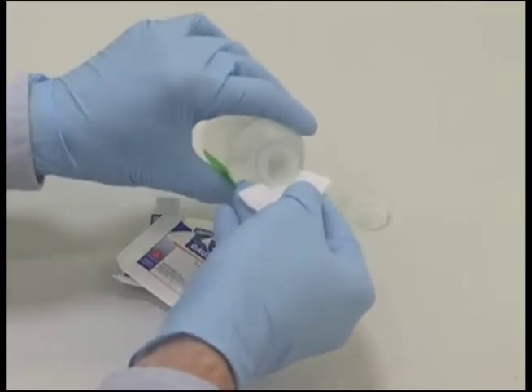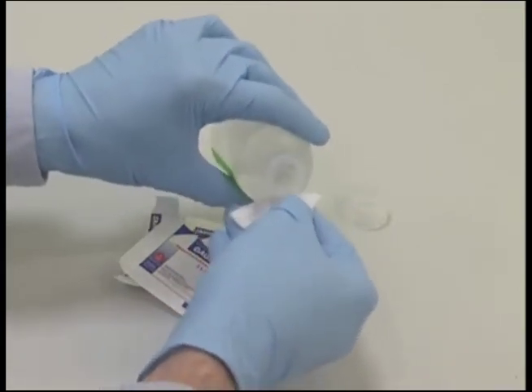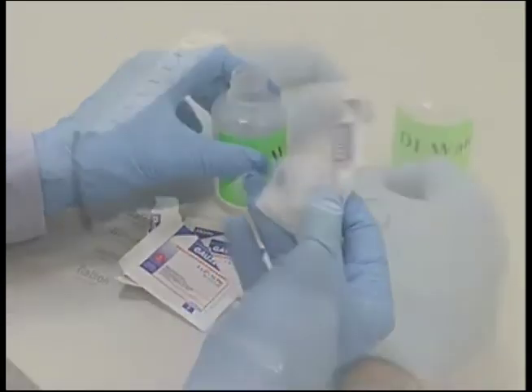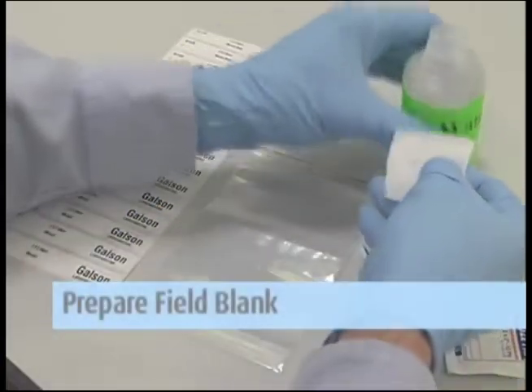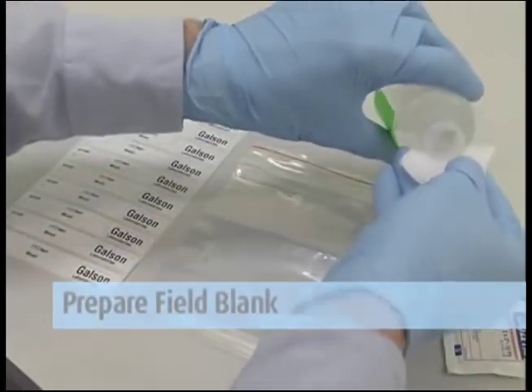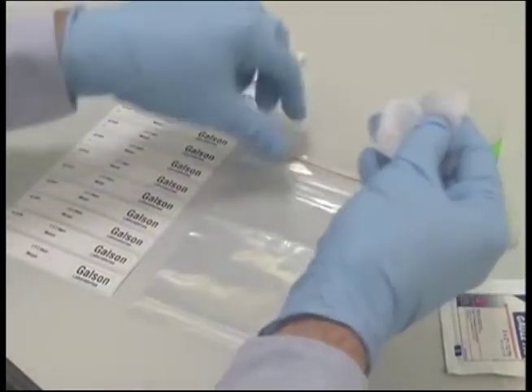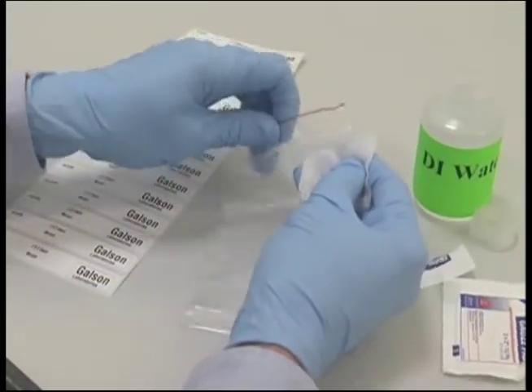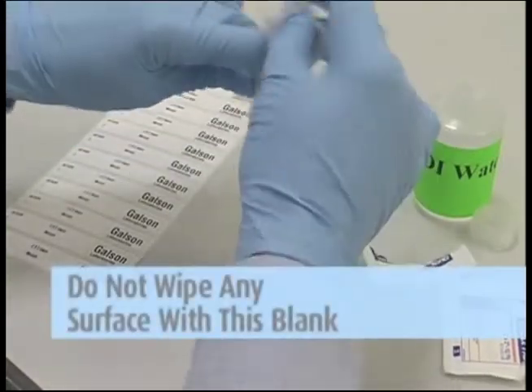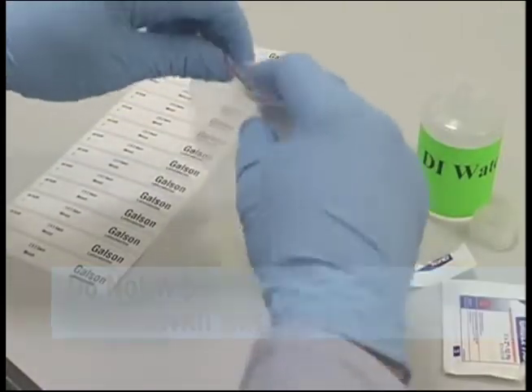The white material should be almost dripping. Now prepare the field blanks for each chemical that will be analyzed. Do this by simply taking a new clean wipe, wetting it with the DI water, and then placing it in a ziplock bag. Do not wipe any surface with this blank.